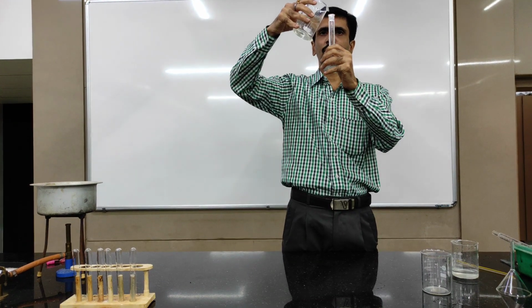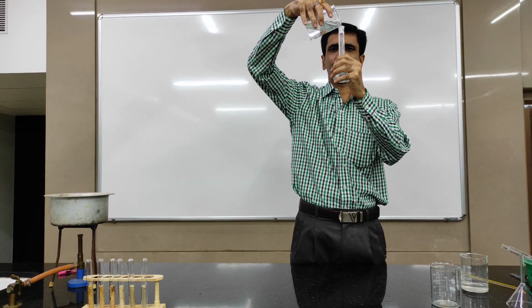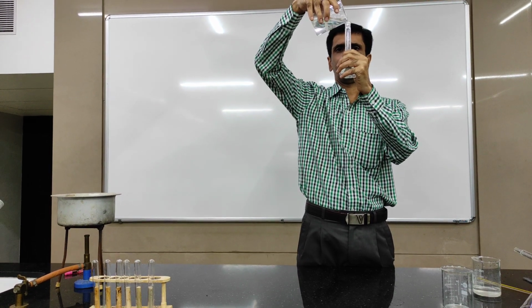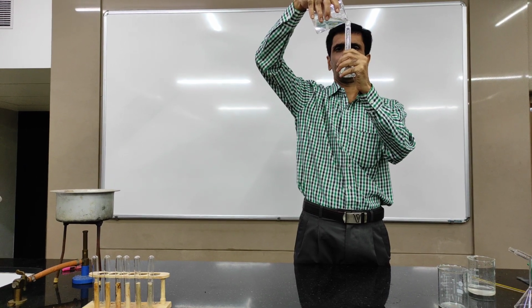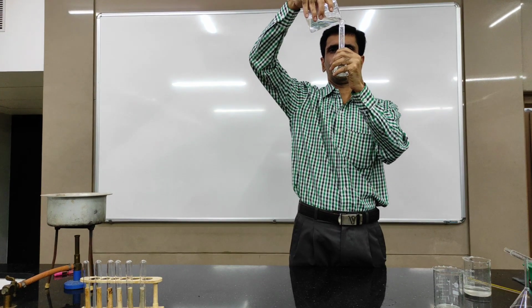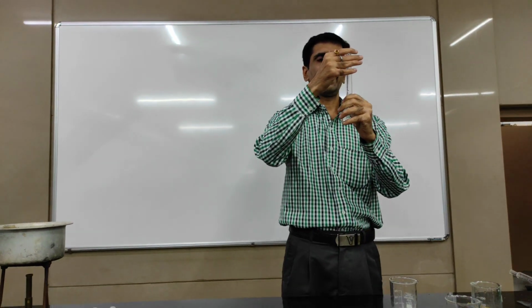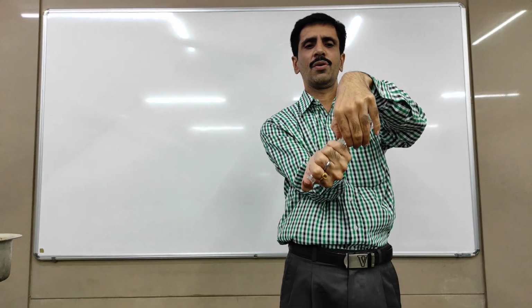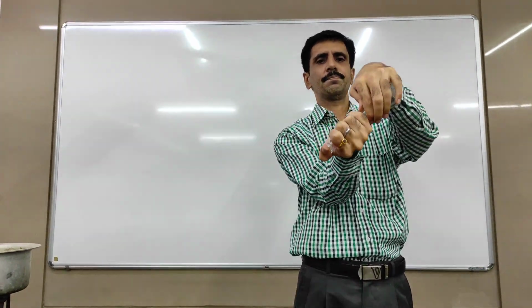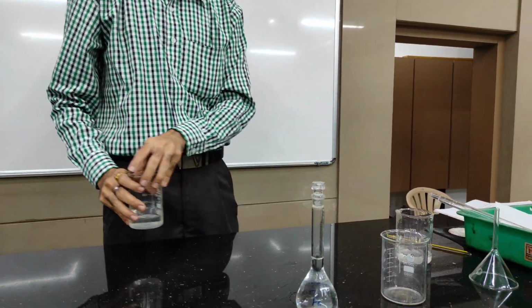This is distilled water, so we are going to dilute it till 100 ml. Please make sure that you are holding the standard measuring flask to your eye level so the dilution is proper. Okay, this is done. This is 100 cm cube. Just shake the solution so as to result in homogeneity. So this is our 100 ml of diluted sodium sulfate solution.